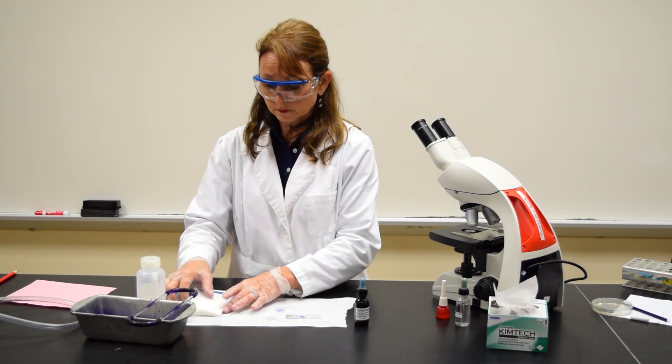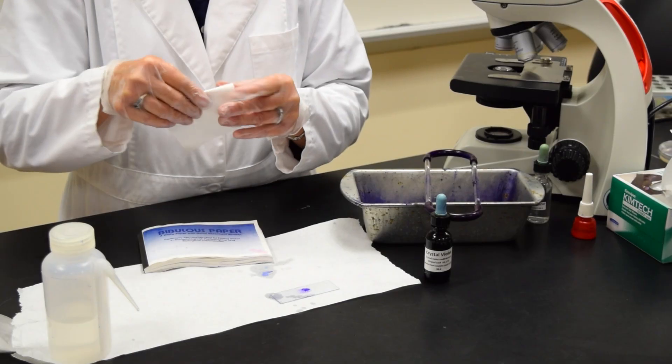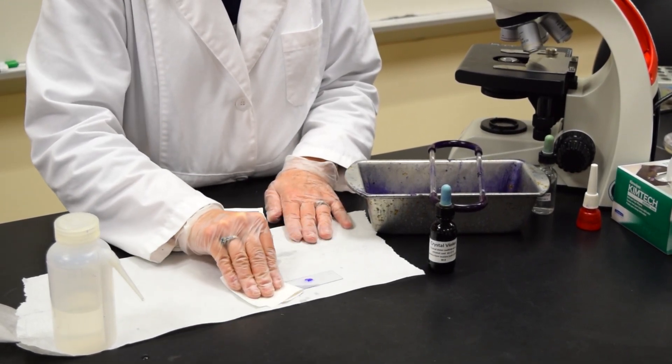Place the slide on a piece of paper toweling, get a piece of bibulous paper, fold it over once, twice, and you gently want to blot the slide dry.